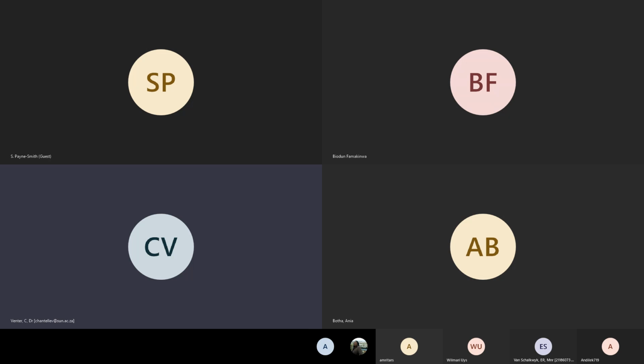Okay, we have a question about food samples. What specifically do you want to know about them? What type of microscope do you need to use? Do you need to stain them? What do you actually want to see with your samples as well?